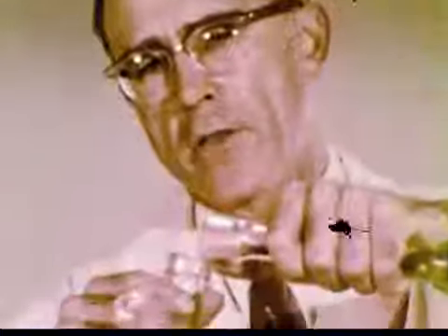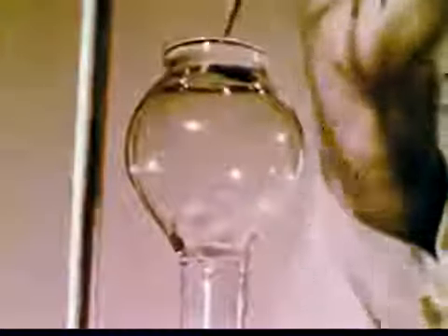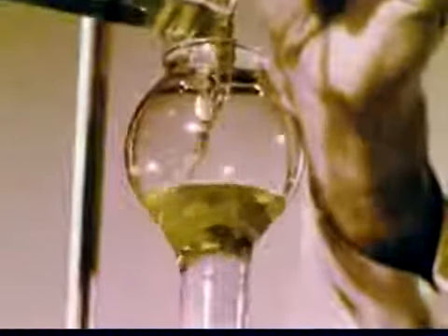Let's transfer 50 milliliters of the vanadium standard solution to a graduated cylinder with an accuracy of half of a milliliter. The solution that we're transferring then will contain 5/1000 of 1 mole of vanadium in the positive 5 oxidation state. The solution is poured into the top of a glass column packed with zinc amalgam.